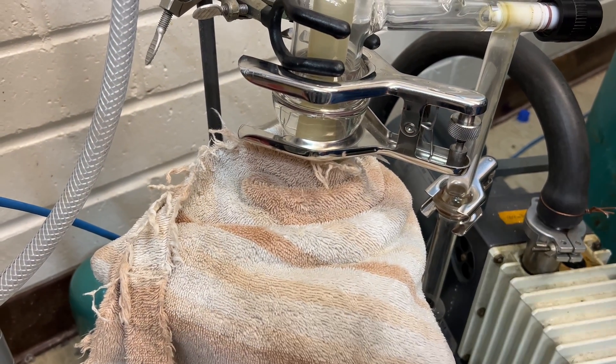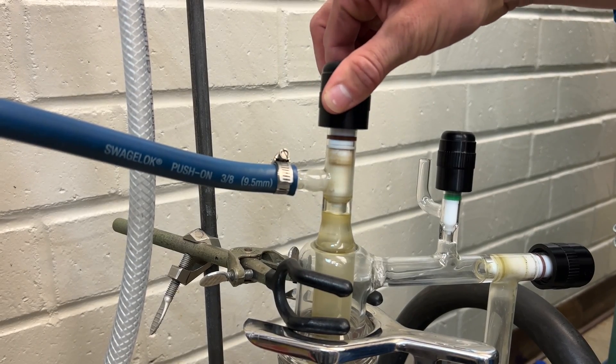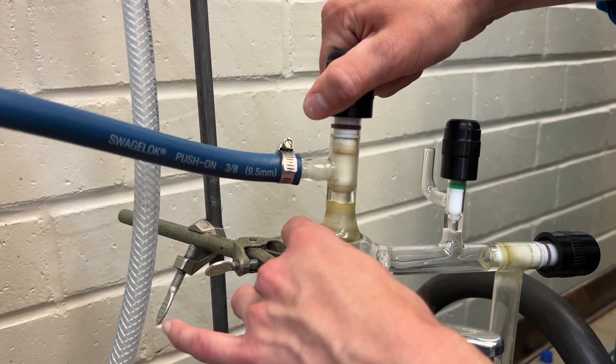From there, we're going to go ahead and open up our main valve to the glove box. And again, you're going to notice a change in sound from the vacuum.